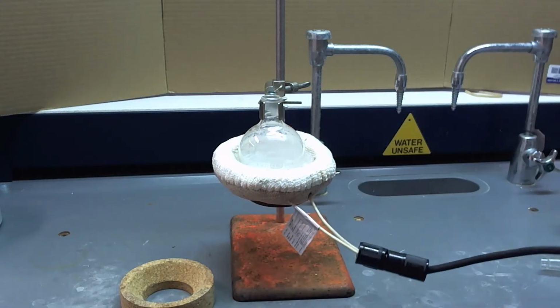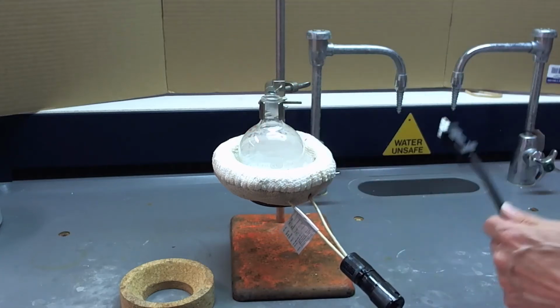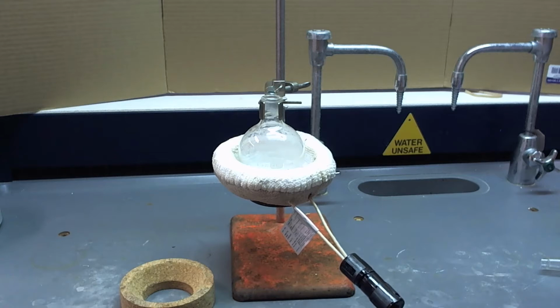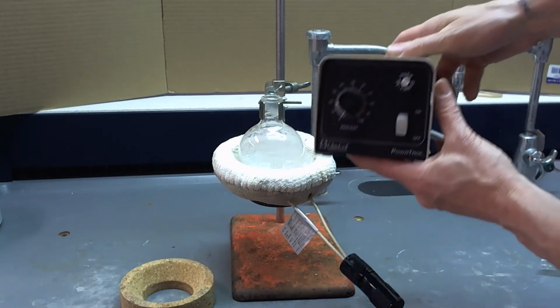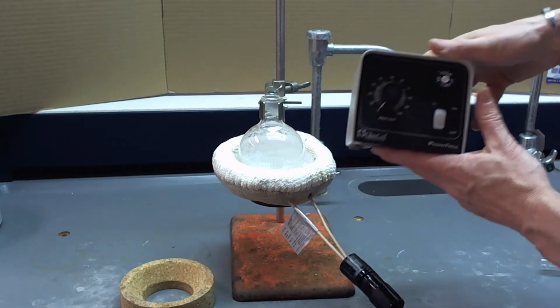All right, now we do not plug this into the wall. We need to give our heat source a dial. So we need what's called a temperature controller. Okay, there's a couple of styles of this in the lab. This is a common one.